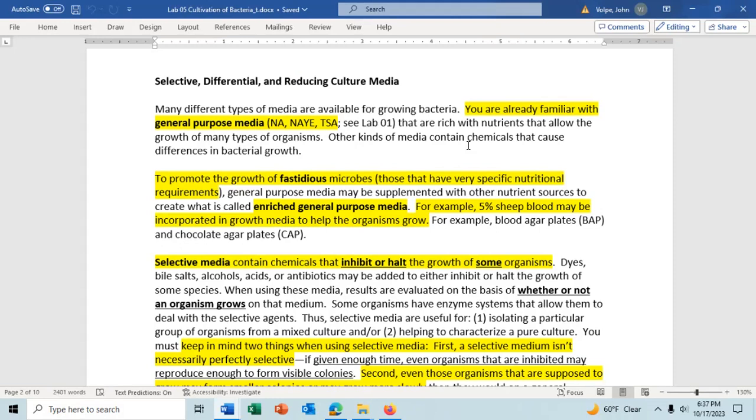And the page will tell you the directions, meaning the additives for that media, and then a little bit about the media. That tells you how many different possible media we have in microbiology, because this is an awfully thick book. This is actually not a book, but it's trying to demonstrate the size of that book that has a bunch of media for you to possibly use.